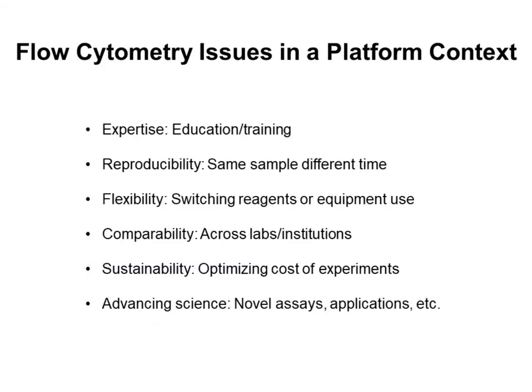In the context of a platform, and specifically for flow cytometry, there are several issues that we have to face daily. These are in terms of expertise of the staff, operators, or users, in terms of reproducibility, and flexibility when we run flow cytometry experiments.